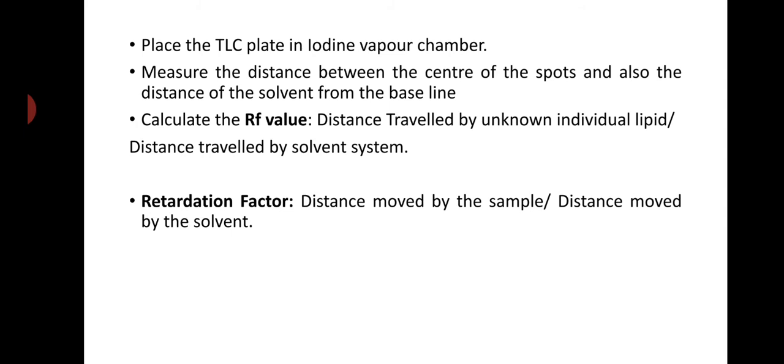You have to remove the TLC plate from that container and put it in a beaker where you have already kept certain iodine crystals. And if you put your slide in that beaker, iodine actually generates fumes, right? So in that fume, you will be able to see the spot on your TLC plate. It will show you a spot of the lipid on the silica slide, right?